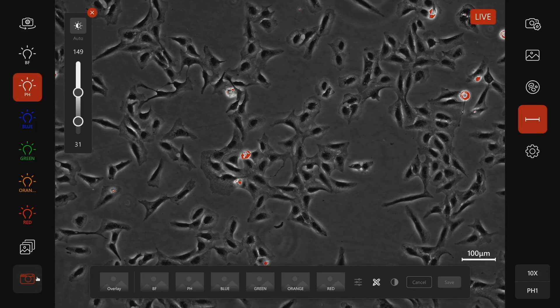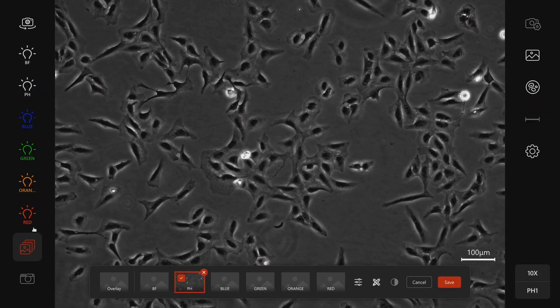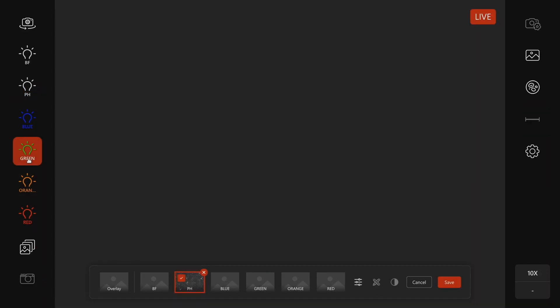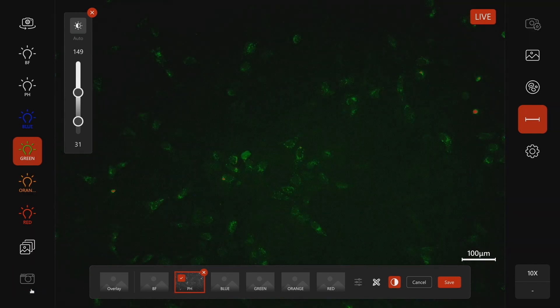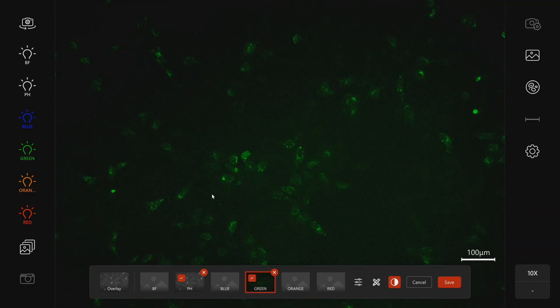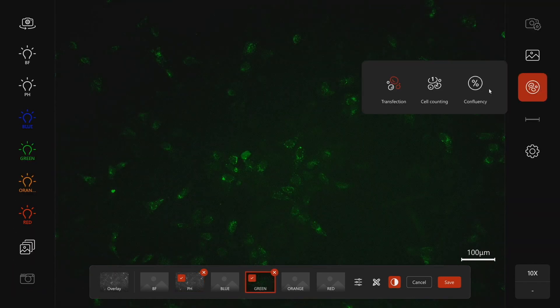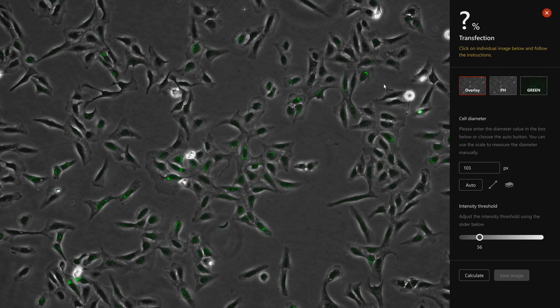Now select your fluorescence channel and capture your images in both channels. Once you have acquired your images, simply click on AI module, go to transfection, and follow the instructions on screen.